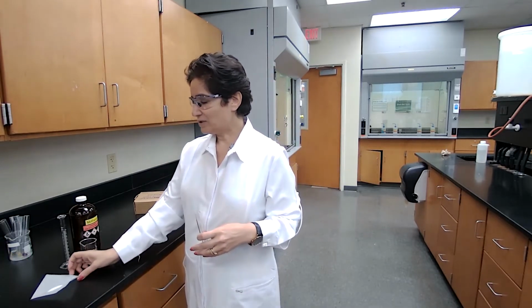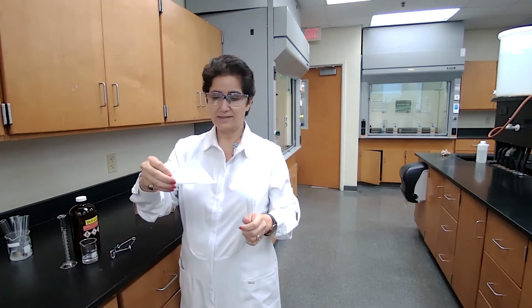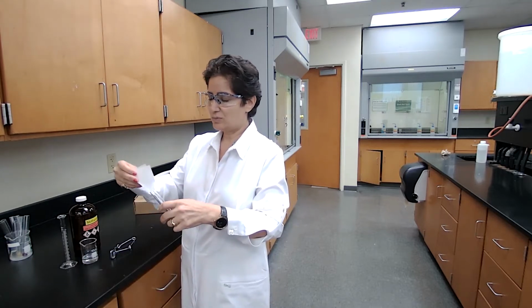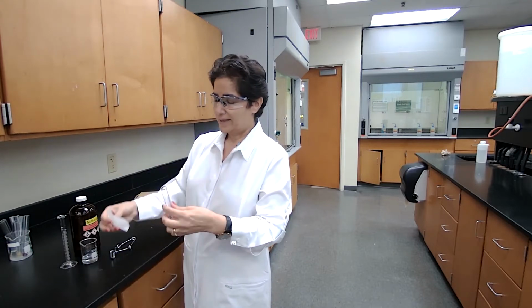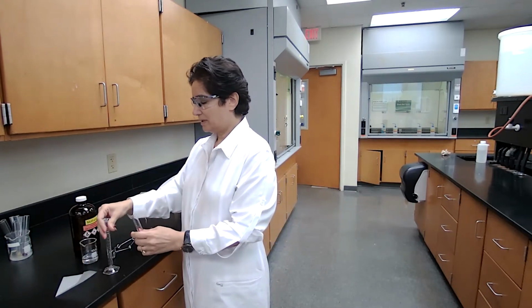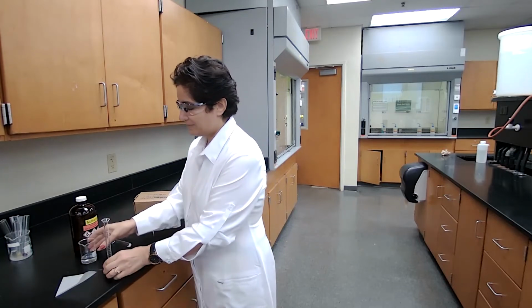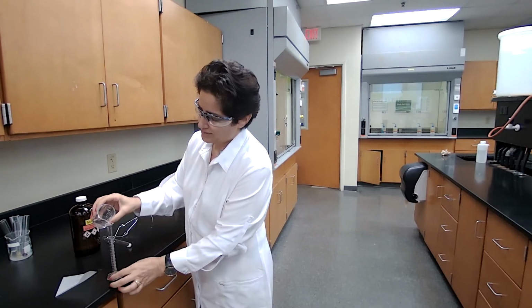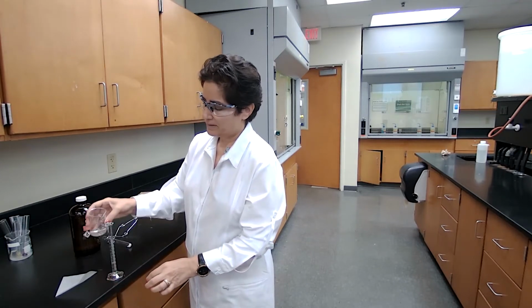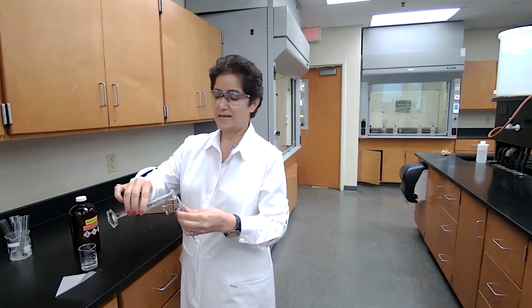I have measured 0.5 grams of salicylic acid, and I will transfer it into a test tube and add 3 milliliters of methanol. I would measure that with the graduated cylinder and transfer it into the test tube.